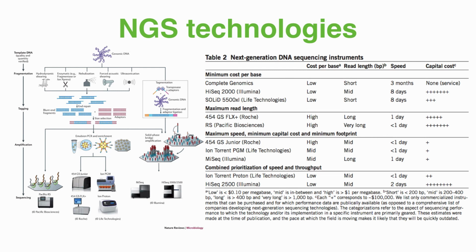This last slide has a side-by-side comparison of the cost and output for the machines we have reviewed. Each of the genome projects has to be planned using cost and output estimates. De novo sequencing asks for higher coverage and longer reads, while resequencing projects may be accomplished with a limited amount of short reads. And don't forget that there is an error rate associated with all of these, and Sanger is still used as a gold standard in verification experiments.